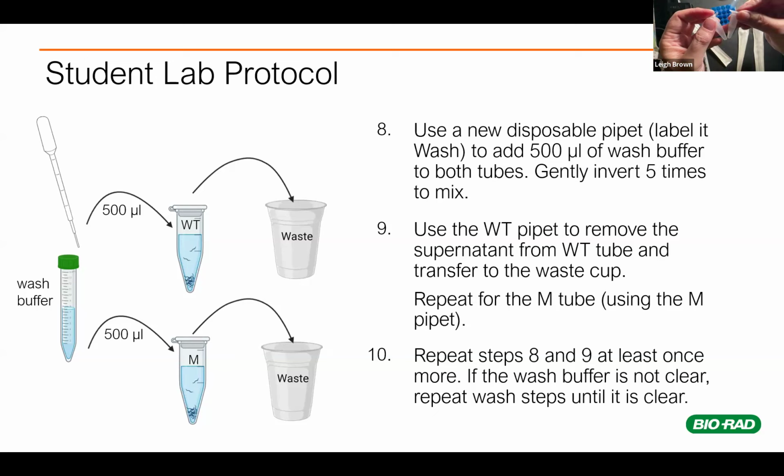And as you can see in Lee's, the ones there, what you notice is it's not quite as cloudy as last time. So we've removed a fair amount of E. coli from that first wash. But remember, we're trying to get these as clean as possible because that means they're going to be as hungry as possible when we put them on the assay plates.